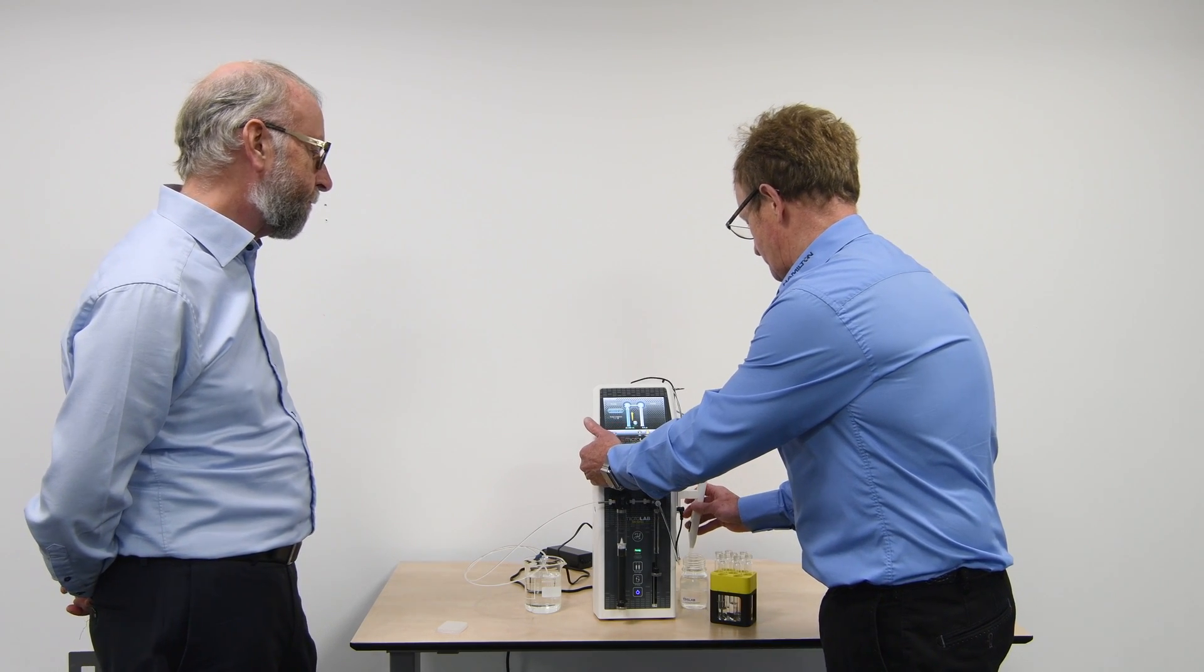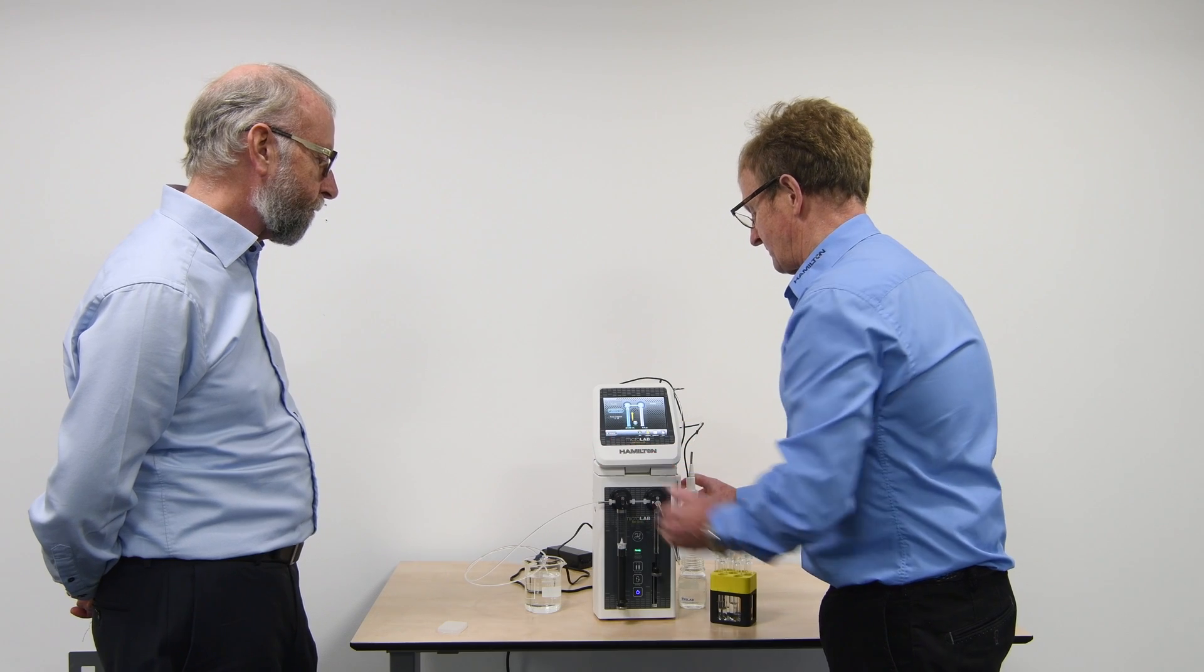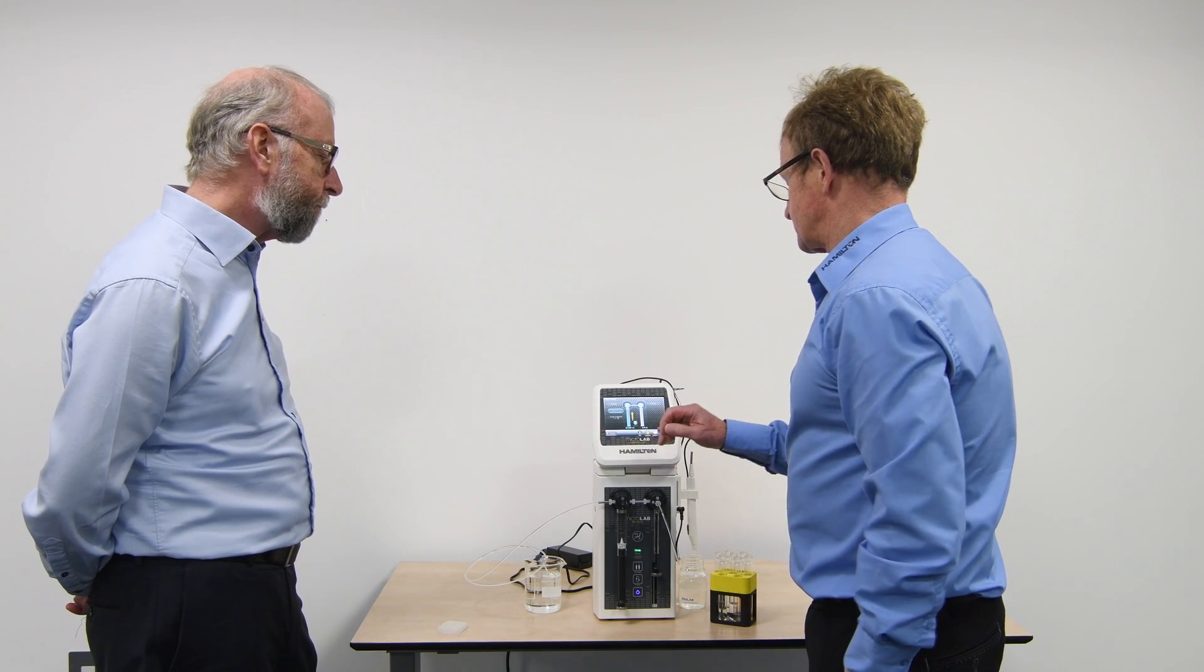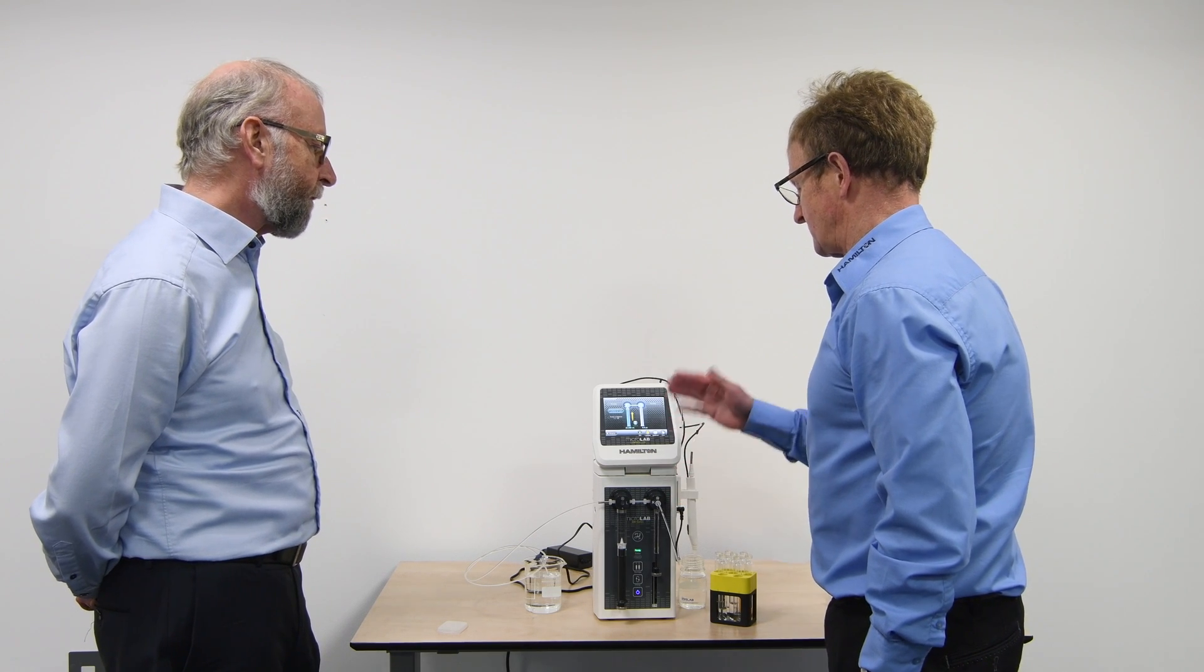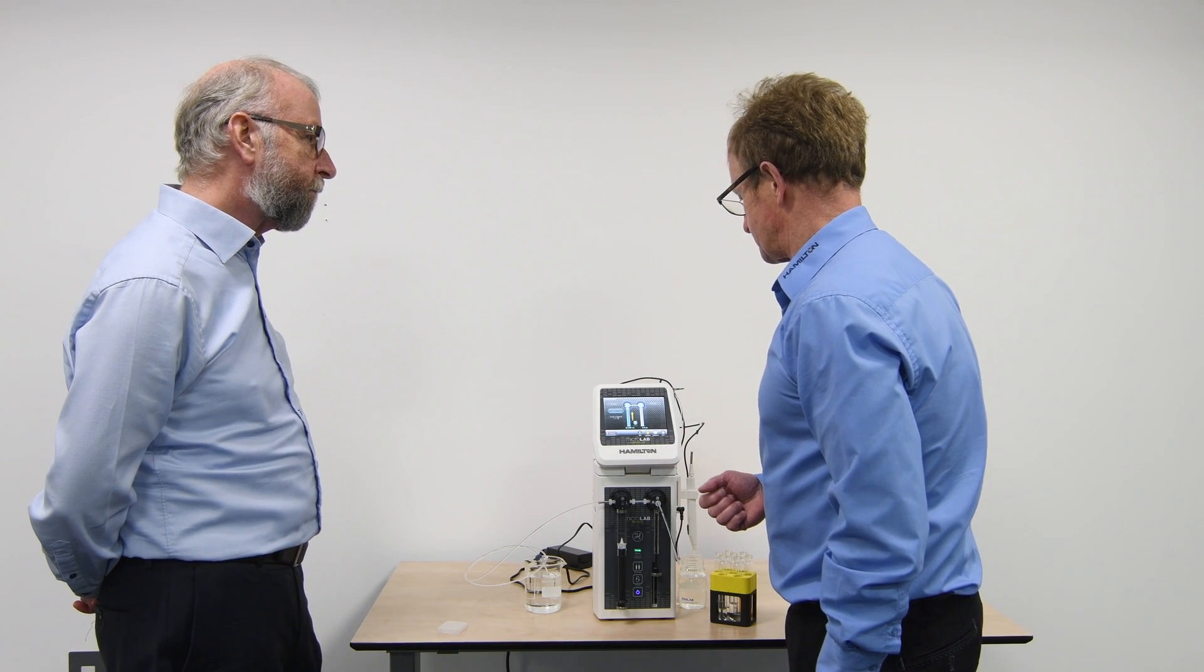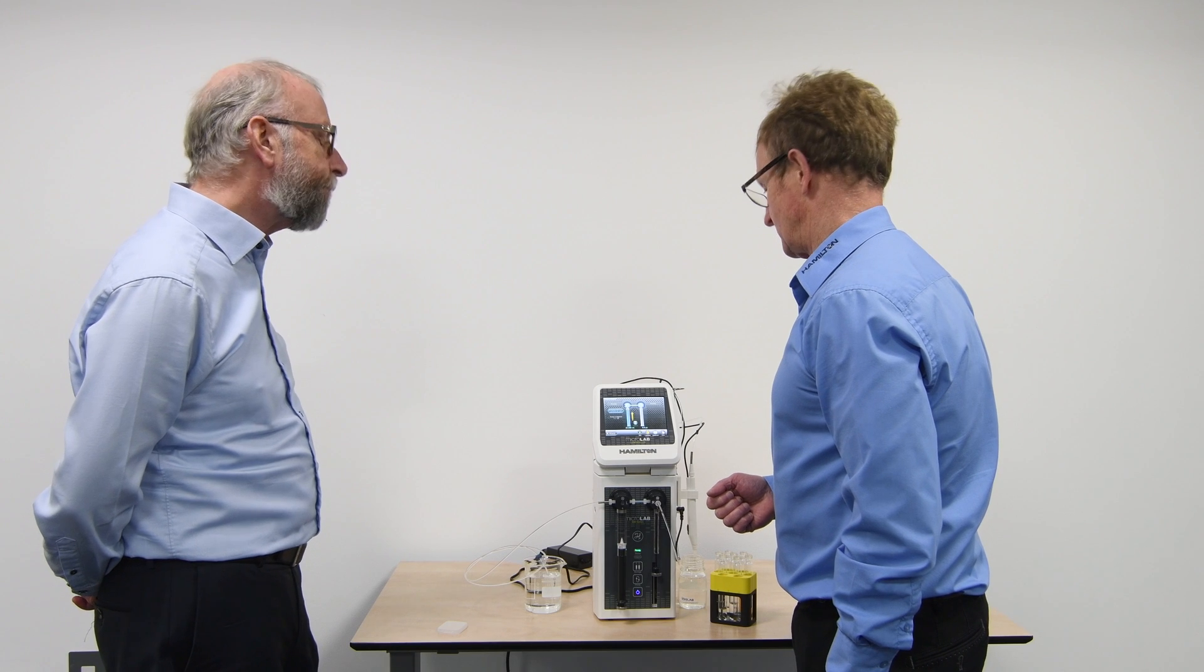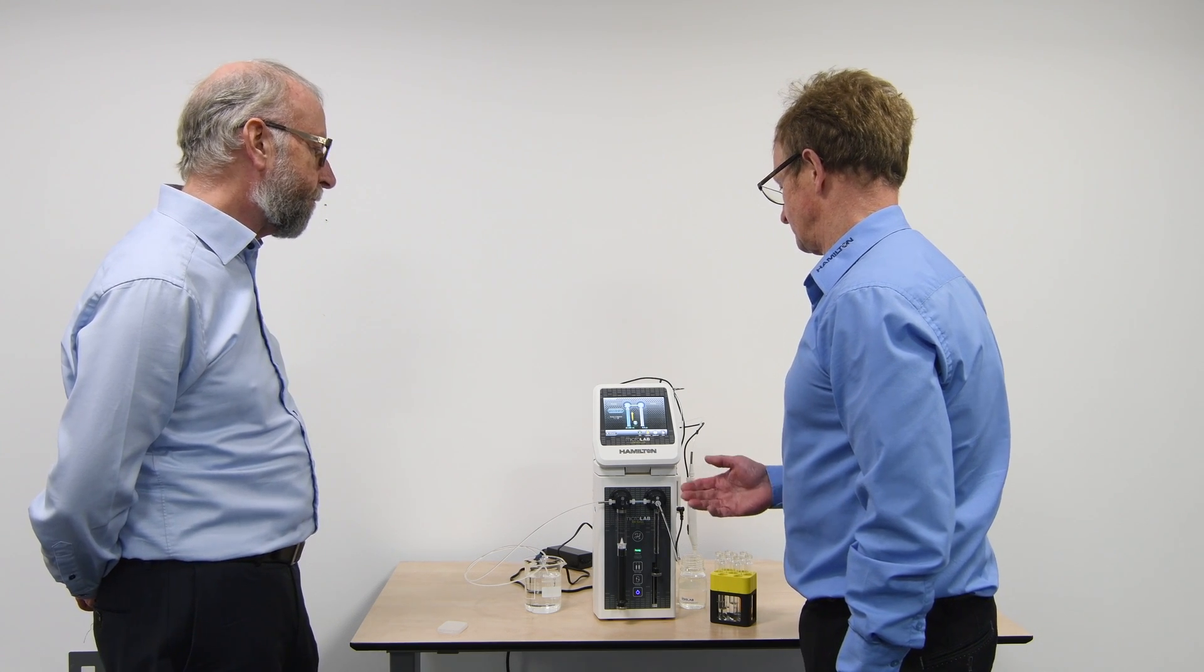Okay, so that's a fairly simple process. Now, we can, rather like other systems, adjust the aspiration and dispense speeds, depending on the solvent you're using, so ensuring that we're getting the correct delivery of the solvent into your vials. Yeah. There you go. Okay, excellent.